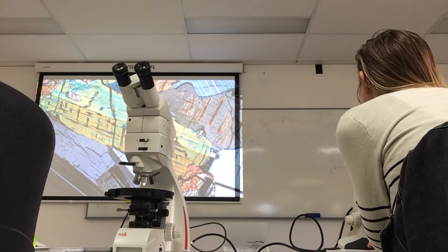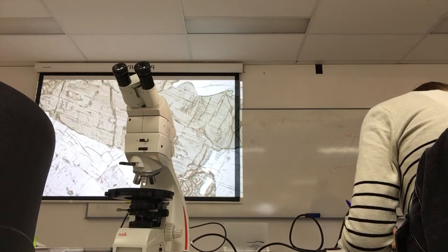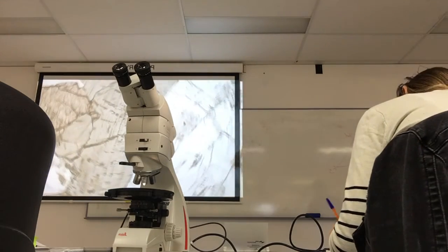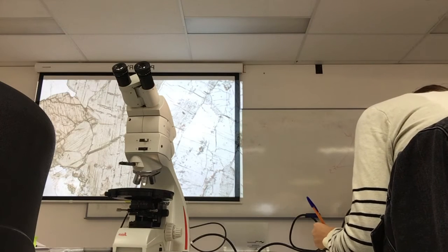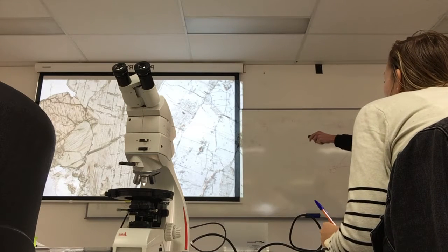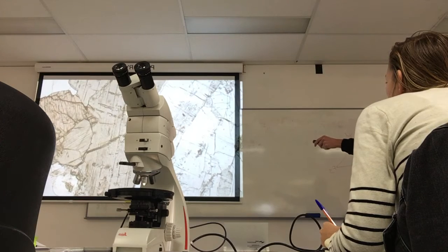If we're lucky, we can see, I don't know whether the camera's going to allow me to do this, but if you keep an eye on it, as the OPX is changing colour. Okay. Let me just get, where's my pointer? A little more pinky grey. That's what I'm looking at. You see it? It's like pink and grey. So that's staying the same. So the augite isn't pleochroic, but these little exsolution lamellae are. See how that changed then? It's green there, and it's got the pinkish colour there.